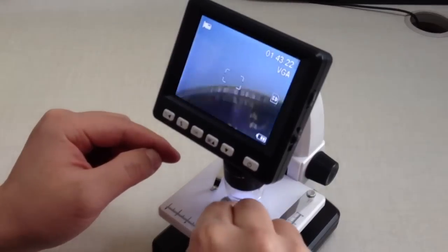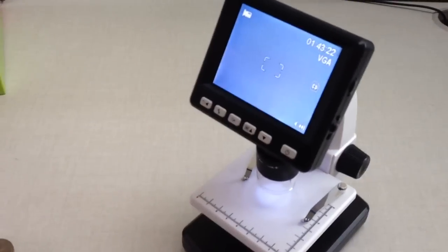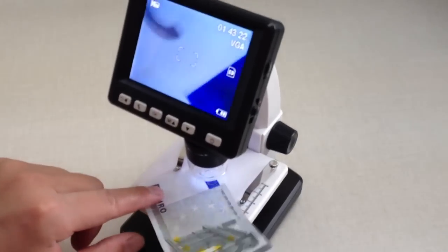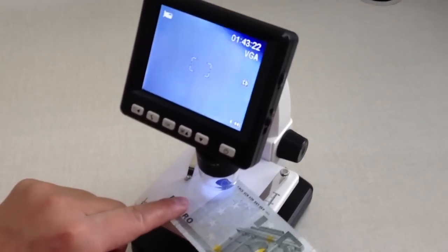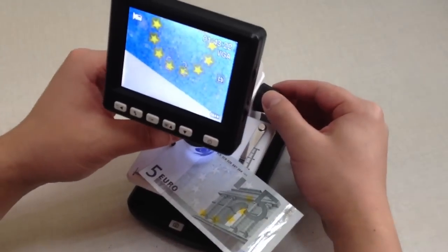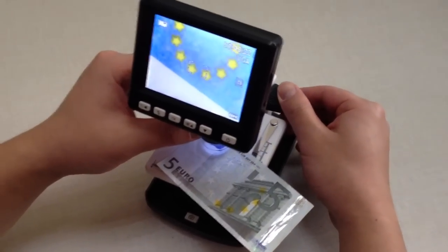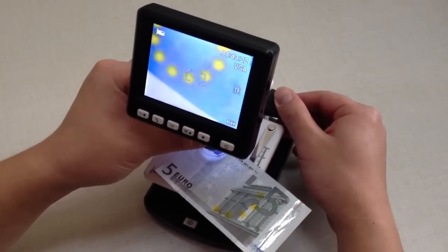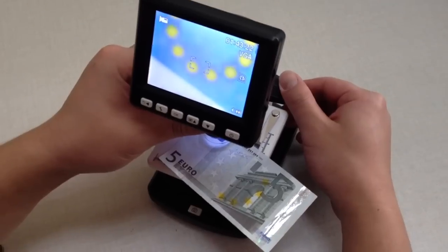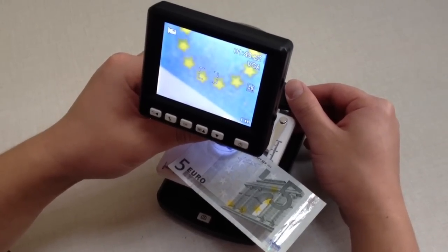You see coins here, and also you can make it bigger if you want to see more detail.